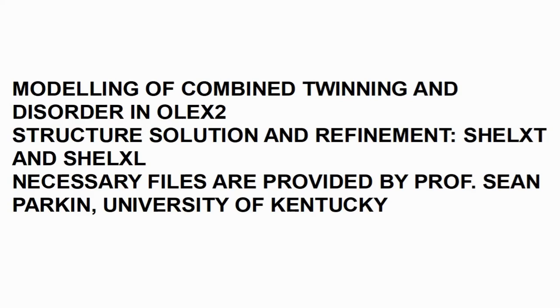Hello everyone. This video tutorial is about modeling of combined twinning and disorder, actually a whole molecule disorder, using the OLEX2 crystallographic software. For the structure solution and the refinement, we are utilizing SHELXT and SHELXL, a very popular program written and maintained by Professor George Michael Sheldrick from the University of Göttingen, Germany. The necessary files are provided by Professor Sean Parkin from the University of Kentucky.